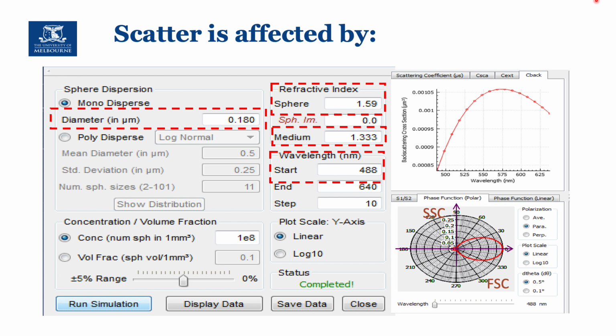Laser wavelength is also very important. So in this case, 488 nanometers, that's what I used for this model, but it's a laser that is mostly used for scatter. It also depends on the orientation of the incoming laser wave. If it's polarized in a vertical manner or horizontal manner, the patterns of scatter that you will get will change. And you can see that based on these calculations, a particle of roughly 200 nanometers using 488 and the refraction index of the particles and the media typically used in the instrument.